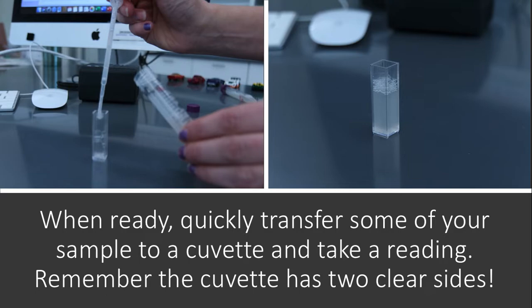So right now you can see this juice inside of the cuvette is somewhat opaque. It's pretty clear, not terribly brown at this point, but it's also not exactly translucent either. So that's essentially the effect we're looking for, is what color is it, and then also how opaque or translucent is it.